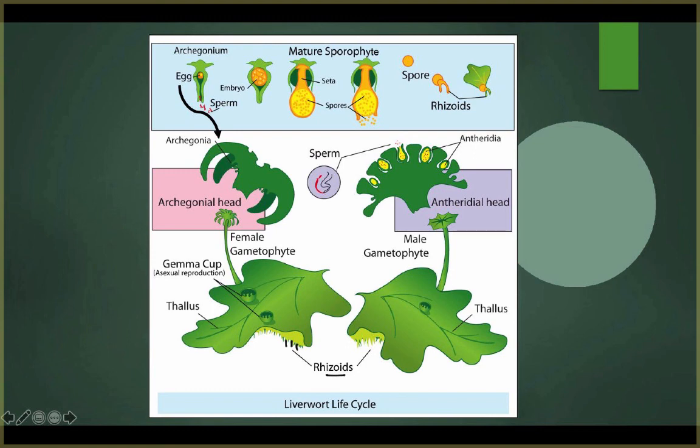This is what we have in lieu of the vascular tissue like xylem and phloem. And so here are hair-like structures. This thallus is going to originate and have this kind of stalk that comes out that produces on a female an archegonial head and antheridial head on a male gametophyte. So these are the actual gametophytes for liverwort.